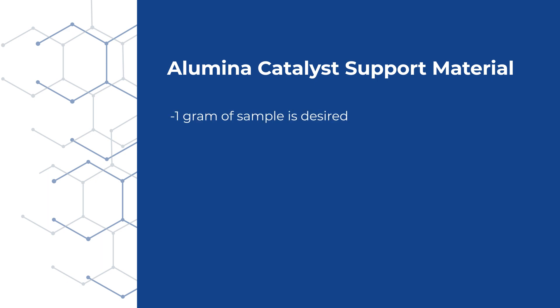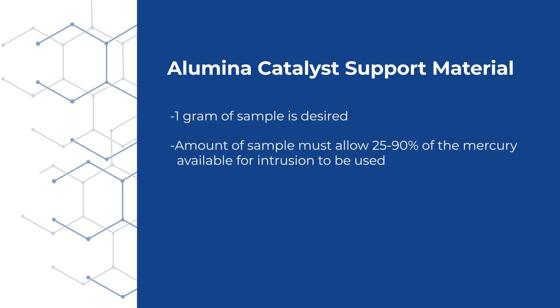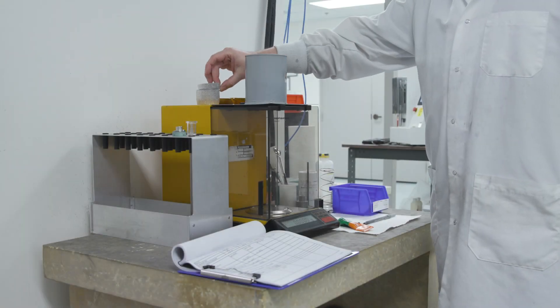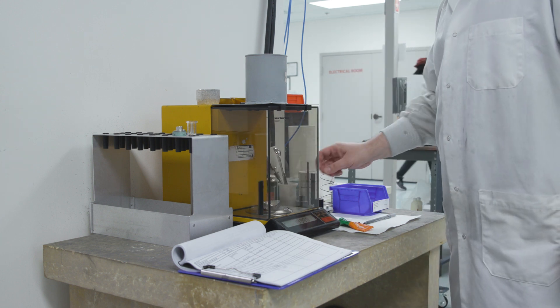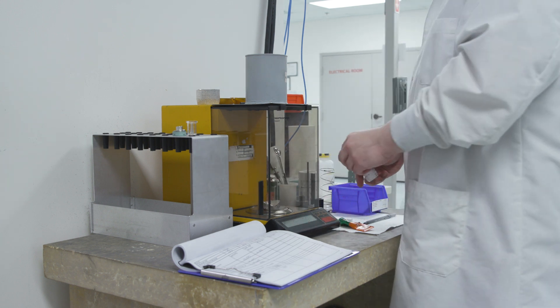Chris has analyzed materials like this before and wants about one gram of sample. We need to analyze enough sample so that 25% to 90% of the mercury available for intrusion is used during the analysis. The penetrometer being used helps to determine the mass of sample needed, as does the porosity of the sample. He starts by taring the balance with a weighing pan, adding the sample, and recording the mass in his laboratory notebook.